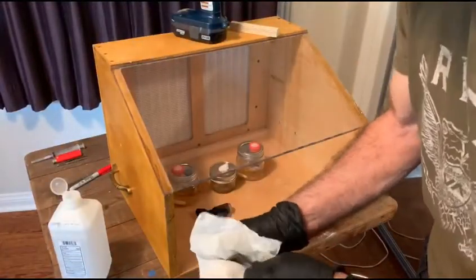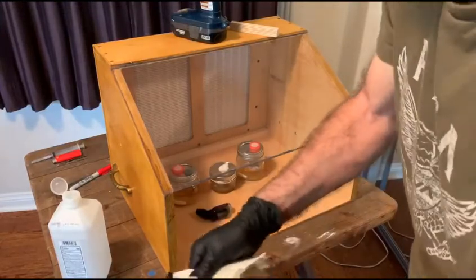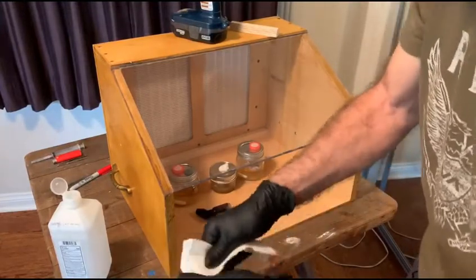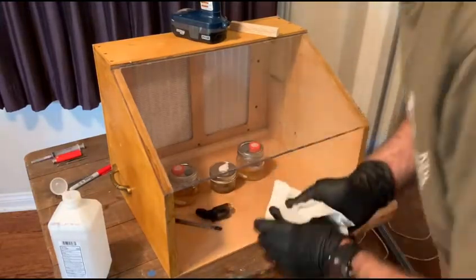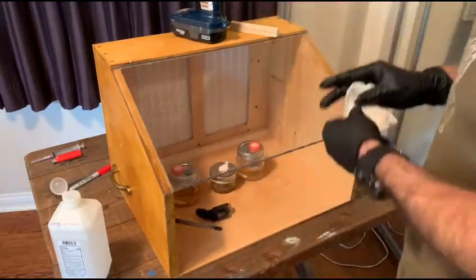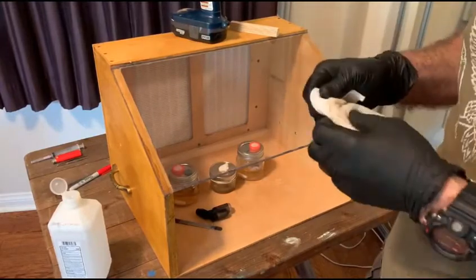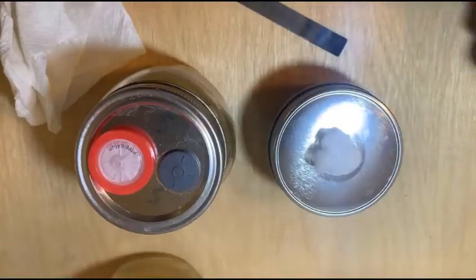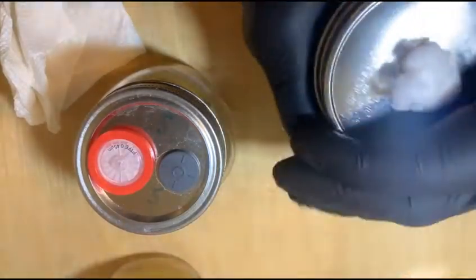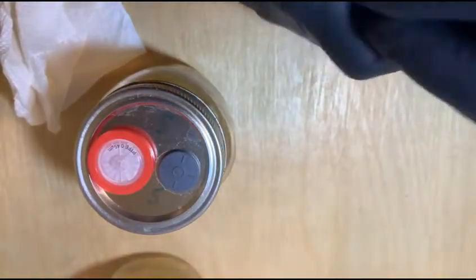I'll only need this tool this time. I'll bring you up close so you can see what's happening inside the box. First thing I do is I crack these guys open, because they can get pretty tight from being pressure cooked.